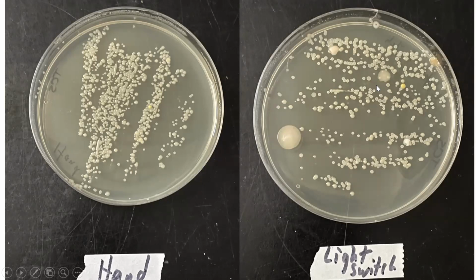That's nothing to be embarrassed of. A third of us probably have it on us right now, right? So it's on your skin, it's natural, it's normal. It's when it gets into other body parts that it can lead to serious things. It's hard to tell without actually doing a gram stain and other tests, but because it's not very yellow, that would be my suspicion. Sometimes the photos don't always show up their true colors as well.